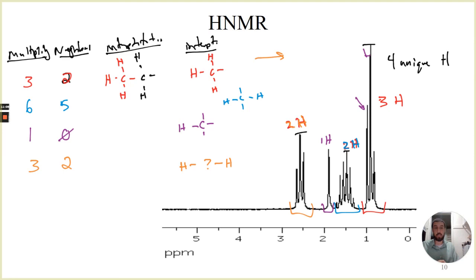One option is now to just continue through and do this interpretation all the way down, which is what's shown in the videos. I also have an option of saying, well, I now know that these hydrogens exist and they have 3 neighbors. Do I have a 2 hydrogen signal that has 3 neighbors? Okay, I don't see any. So that could just be a dead end, so we could accept that and just go through. I think I may have just undone more than I wanted to, and we could just go through our standard method. Hydrogen, hydrogen, right? 5 neighbors?